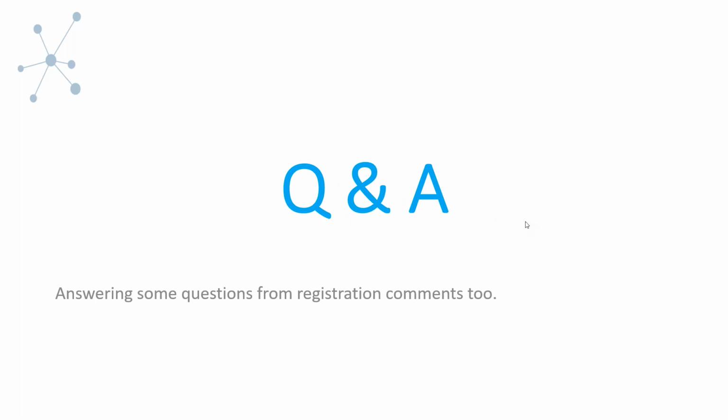So let's see. Someone's asking about a future webinar on wall slip, and yes, we can definitely do that. What we didn't get to mention is that, as I said, when I made the title, I overstepped my bounds, and we can't cover everything. I feel kind of bad because I said look out for all these problems, but then I didn't tell you how to handle them, because you can identify whether you have wall slip, and you can do this depending on the instrument you have.